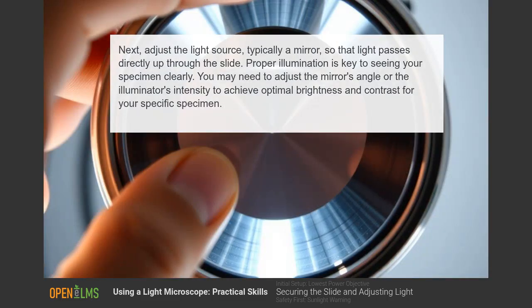typically a mirror, so that light passes directly up through the slide. Proper illumination is key to seeing your specimen clearly. You may need to adjust the mirror's angle or the illuminator's intensity to achieve optimal brightness and contrast for your specific specimen.